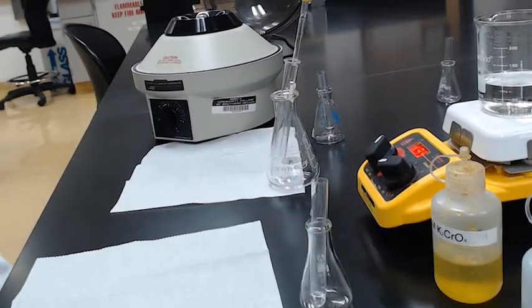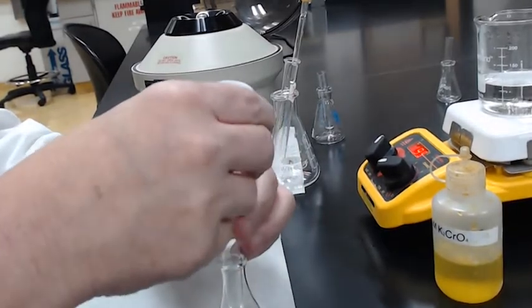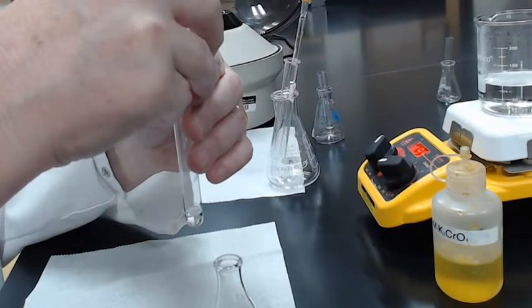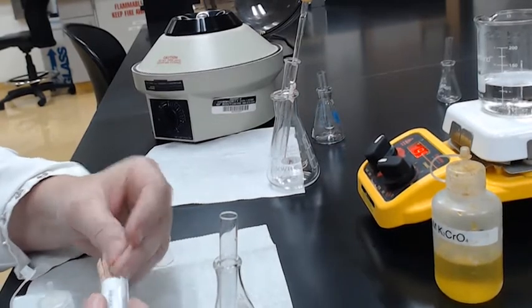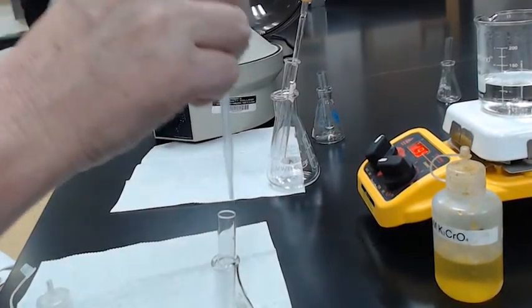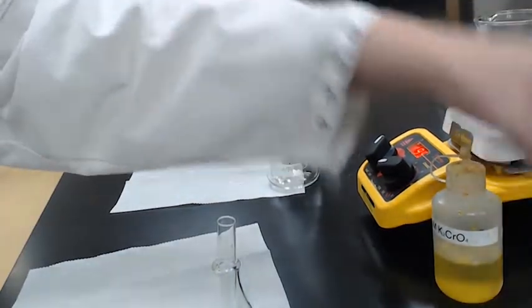So if you've added just enough acid, now we're going to make it basic by adding some dilute ammonium hydroxide, some 5 molar, and on average this only takes 2 drops. Again, as long as you didn't go overboard on the acid, and our concentrations are good. Alright. At this stage, you're supposed to test for basicity with red litmus paper. So we're going to do a quick test to make sure it actually is basic. And we're going to do it with this dropper. Without getting a drop, we're just going to touch it. And you see how the litmus paper turned a lovely shade of blue. So we are basic. We did it with 3 drops. Probably should have tested at 2, but it'll still work.